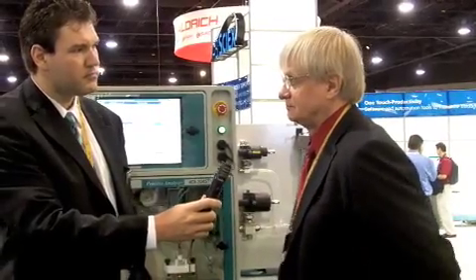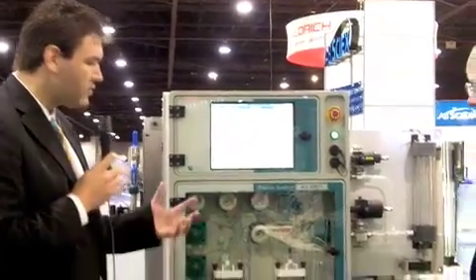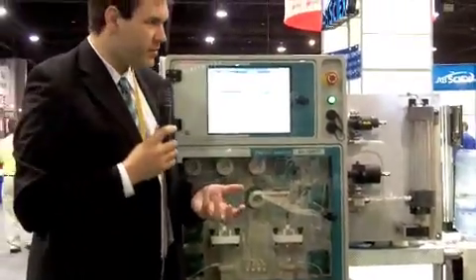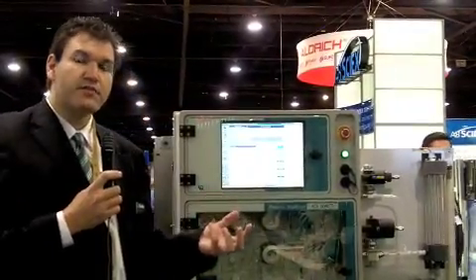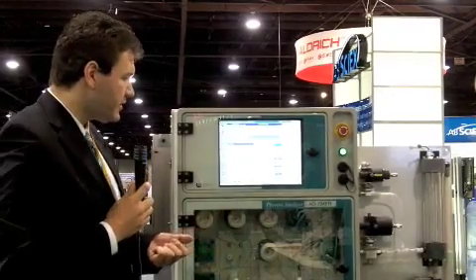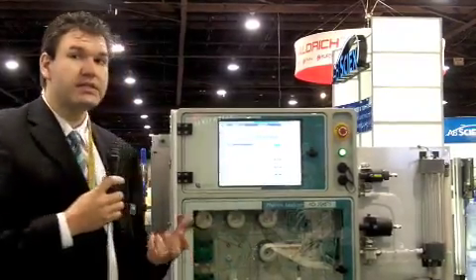What makes it different is that Metrom USA offers a solution capable of handling various different parameters — it's not just a single parameter we can analyze. We can even combine different analytical techniques like titration, colorimetry, ISE measurements, and other techniques to ensure the analyzer perfectly fits the demands of the process.